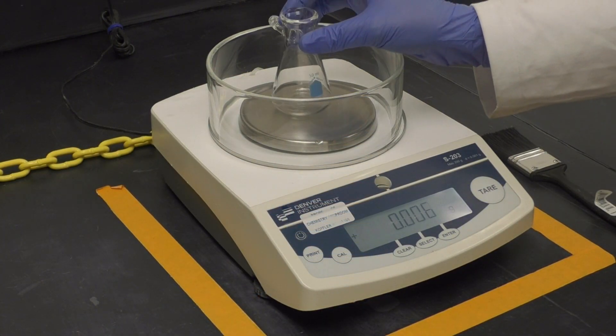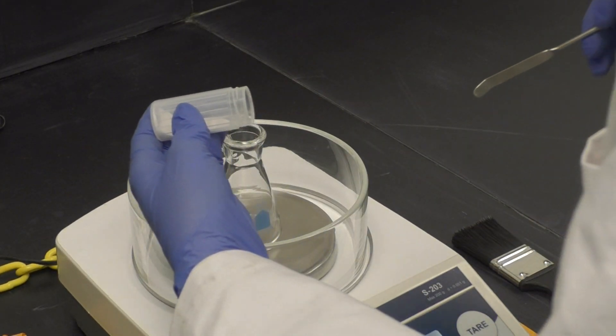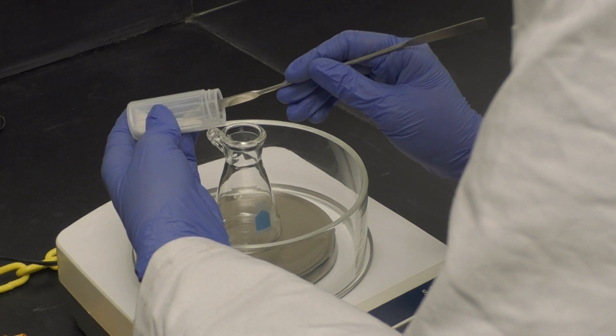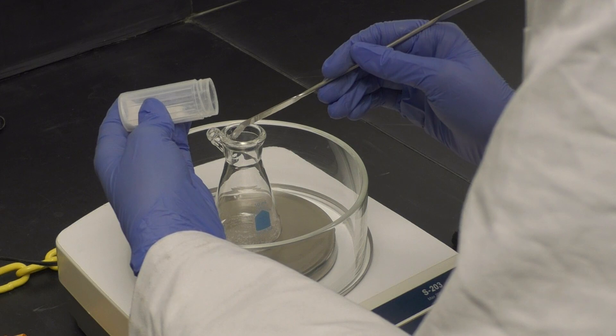Now you will prepare your solid. You will weigh everything directly into the filter flask, so place that on a balance first and tare it. Now carefully weigh out your pure solid or ground up antacid tablet directly into the flask.